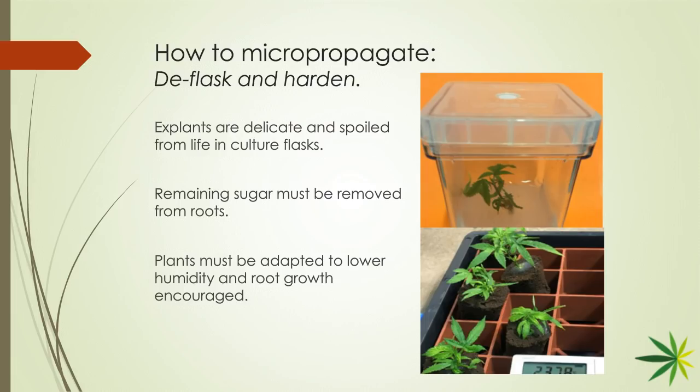there's a balance you have to strike. When you yank these things out of the agar, you can damage their roots. But they work so hard to grow. But if you can get the timing right, they don't have a whole lot of roots, but they're just ready to blow up. Cool. On root growth, this was a variation on a method that we tried quite a while ago that just used that same gel material to hold them in place. It was very successful in the pilot that we tried. We've moved on to other methods, but it was a very useful method.